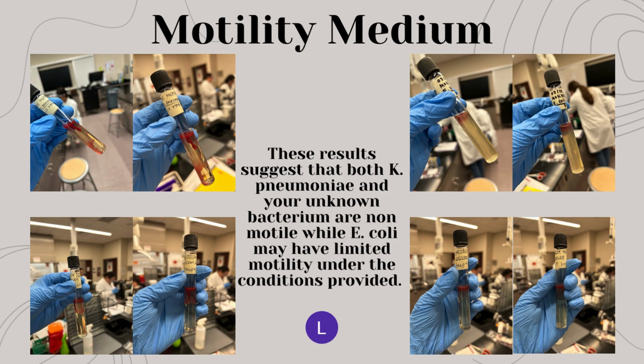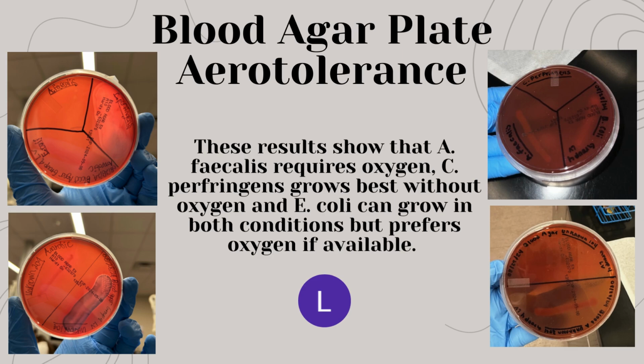And also you can see that for E. coli and unknown 104, which are the ones on the right, the top is E. coli, the bottom is 104.